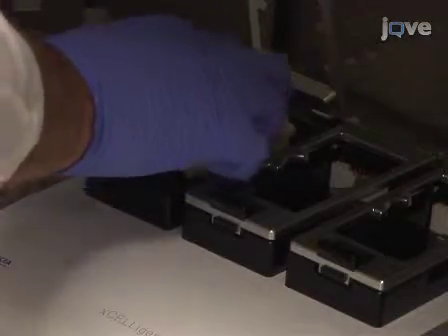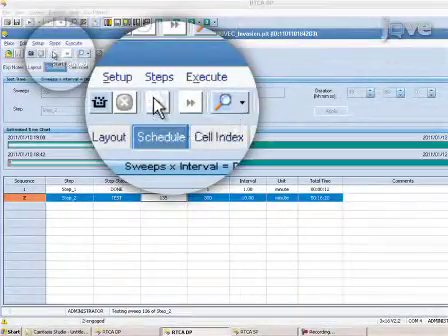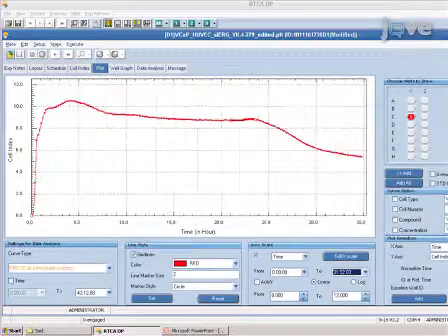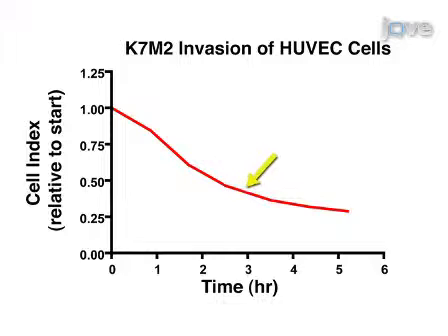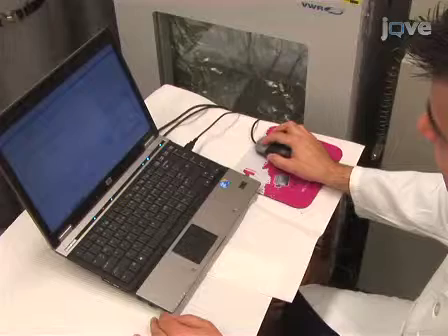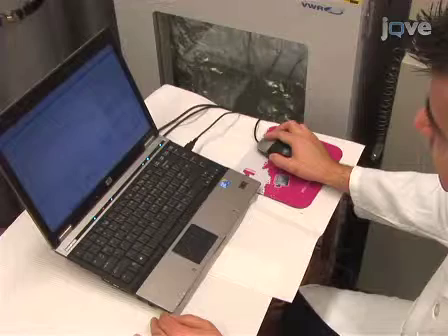Place the E-plate back in the Accelogenz system in the incubator. Click on Continue Step to continue taking impedance readings at 10-minute intervals. Monitor the invasion in real-time over the next 6 to 12 hours. A drop in cell index will result from the retraction of endothelial junctions and penetration by invading tumor cells. When the experiment is finished, use the Accelogenz software to normalize the results to the time of addition of invading tumor cells. The Accelogenz software permits normalization to any time point.